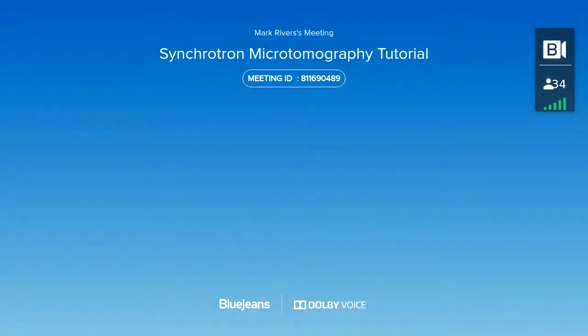Mark, it's Doug. I just got one question. When you were showing the phase contrast image reconstruction, there was kind of a bunch of concentric circles. Is that more an instrumental artifact, or was that some scattering of something within the sample, or did that come in the reconstruction?